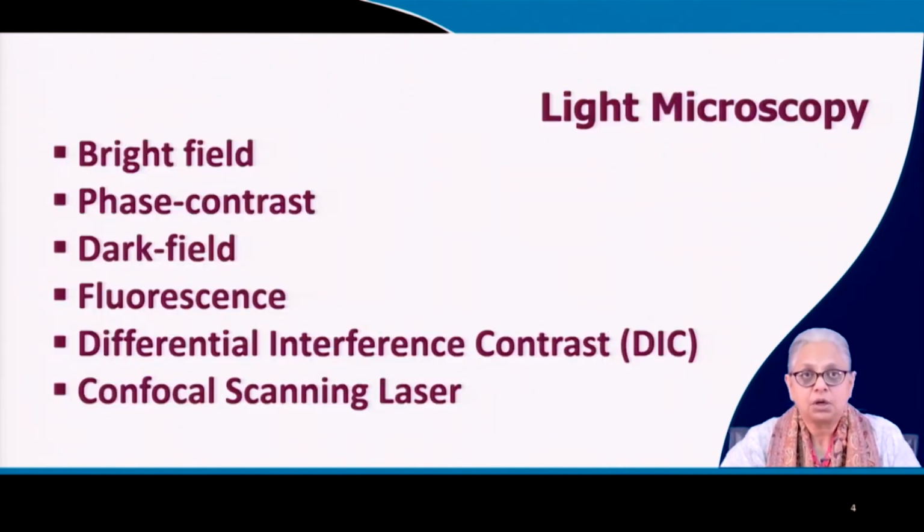How do we resolve objects? Or rather, what are the limitations when we are trying to resolve objects under the microscope? So that's what we're going to cover in this particular part. And like I said, this part is light microscopy, and that's what we're going to focus on.